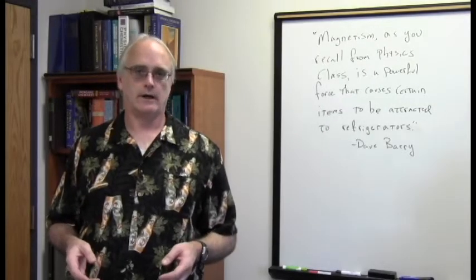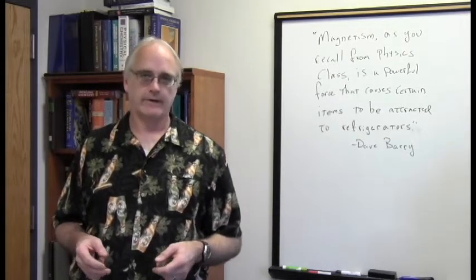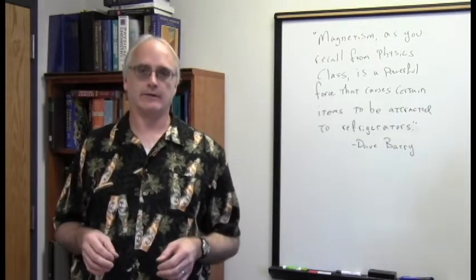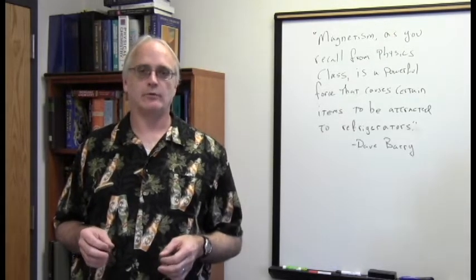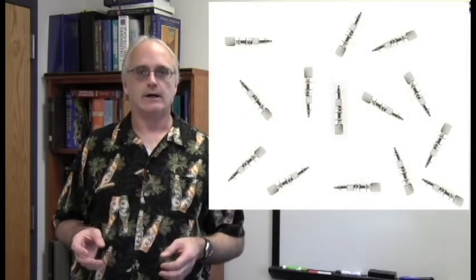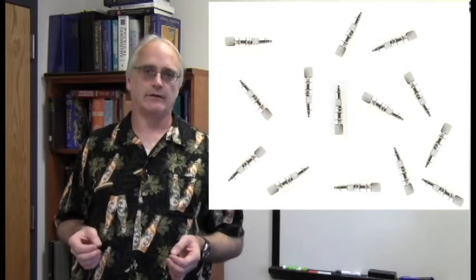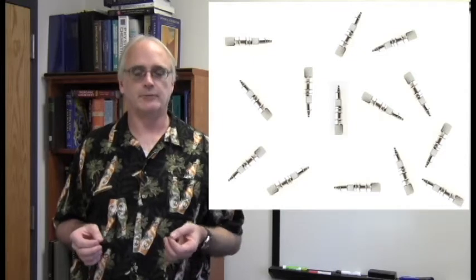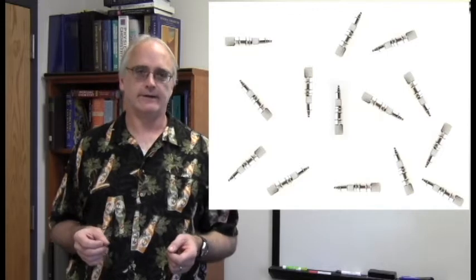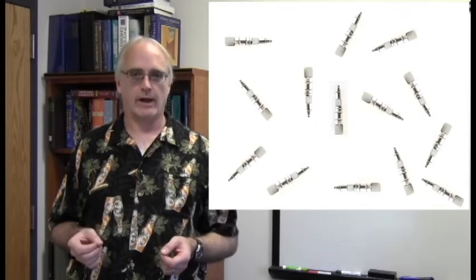When we do real NMR spectra, of course, we don't have just one magnetic nucleus, we have several. We have millions of them, billions, zillions, lots of them in our NMR tubes. And therefore, a somewhat more realistic picture would be something like this, showing many magnetic nuclei. And notice how I have them oriented randomly, some with their north poles up, some pointing down, some to the left, some to the right. The idea is, outside of any external magnetic field, the magnetic nuclei will be oriented randomly.